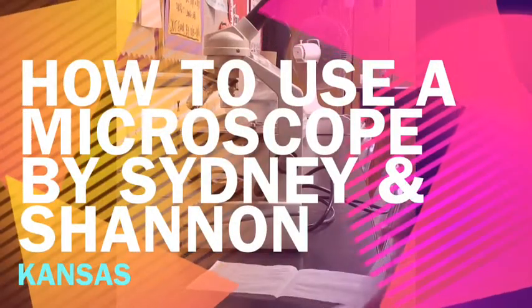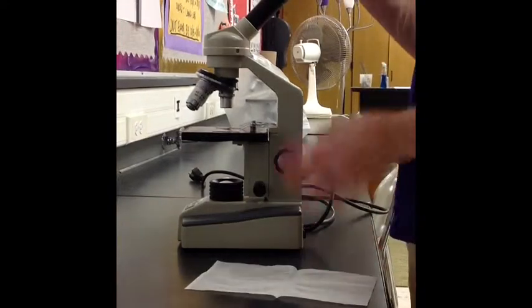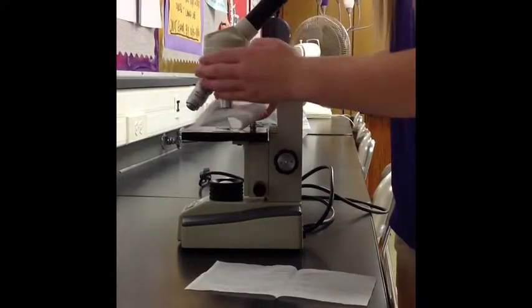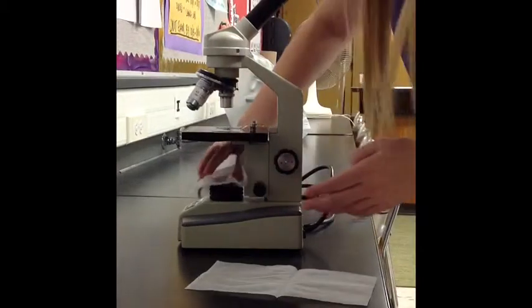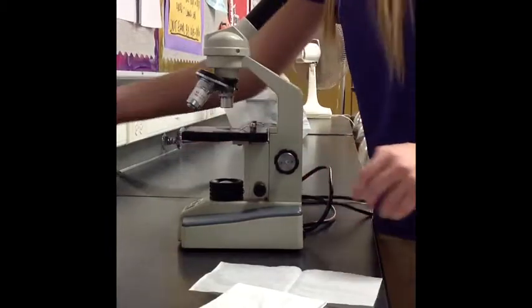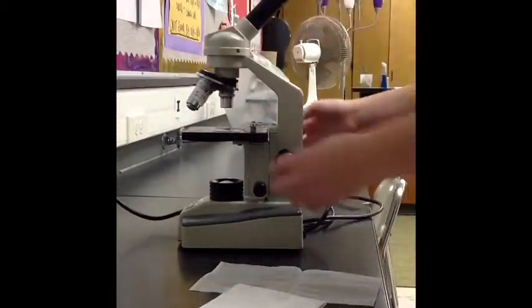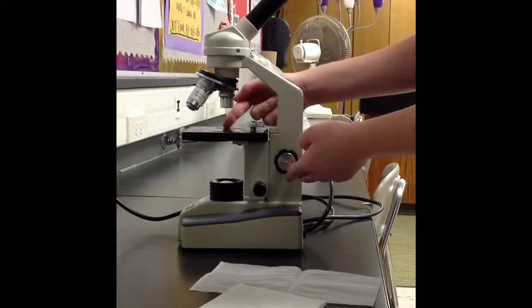There are a few things you need to know before using a microscope. The first thing you need to do is clean the lenses with a Kimwipe. After you have done that, you can plug it in. Now lower the stage as low as it goes, and rotate the nosepiece until the smallest objective lens is directly over the light source.